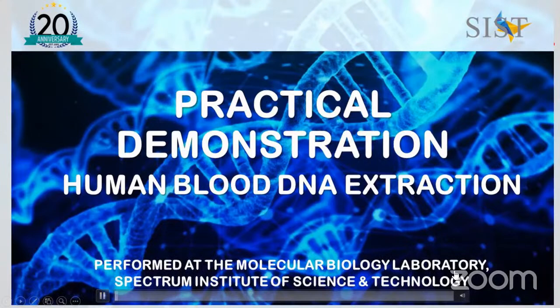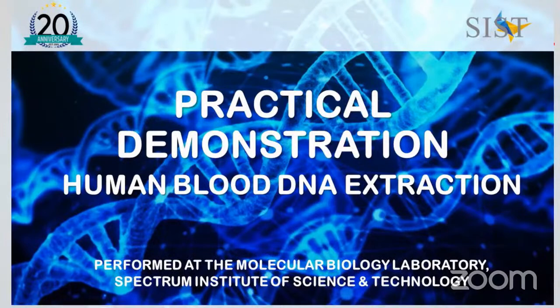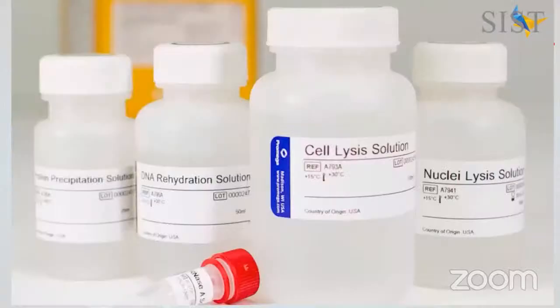Welcome to the practical demonstration on blood DNA extraction. All laboratory procedures were conducted at the Molecular Biology Laboratory at Spectrum Institute of Science and Technology. The laboratory method followed the standard protocol given by the Wizard Genomic DNA Extraction Kit offered by Promega.